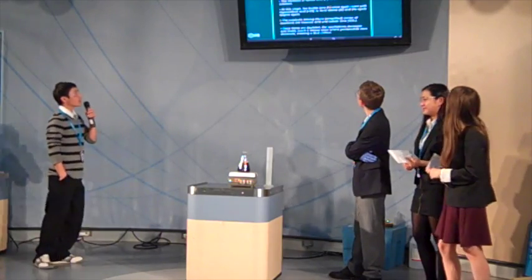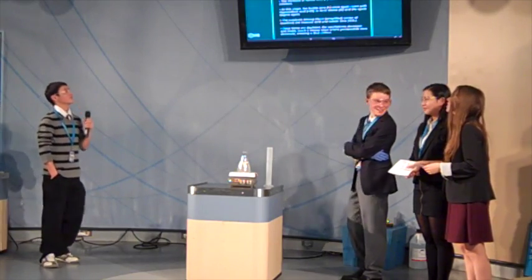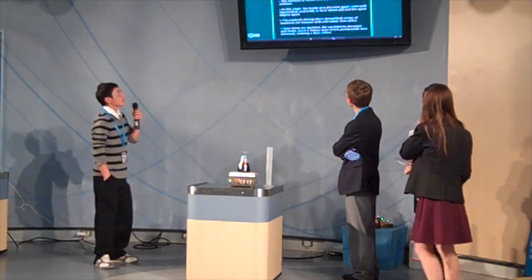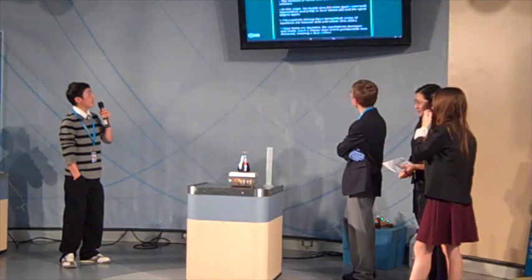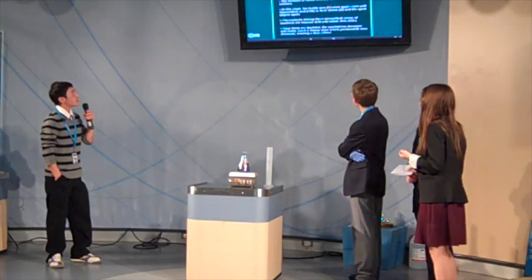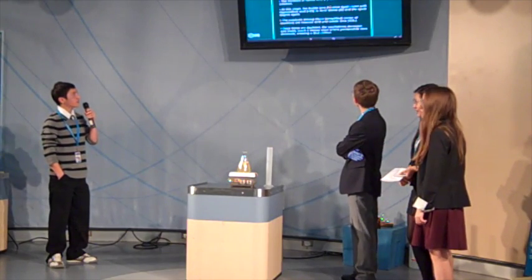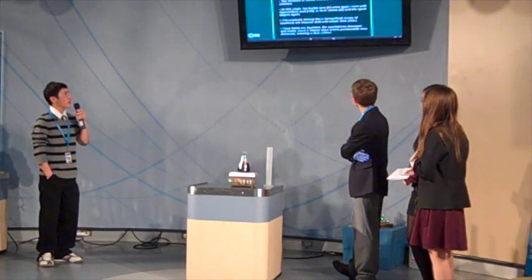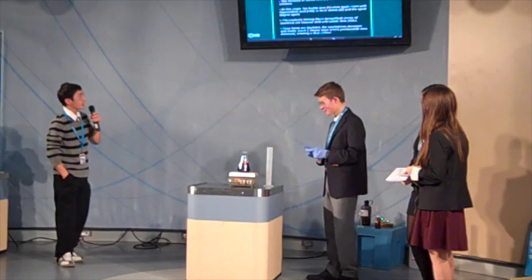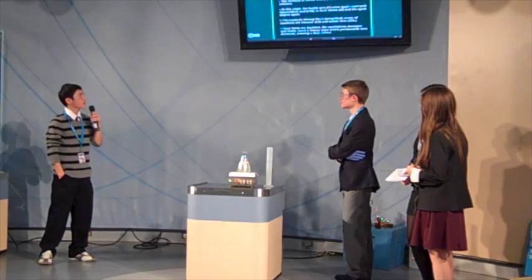Alright, so I guess the yellow color is generated when iodide ions react with the hypoiodous acid to form iodine. The blue color occurs when iodine reacts to an increase in iodide ions in the presence of starch, forming pentaiodide ions. This reaction consumes iodide faster than it is produced, causing the concentration of pentaiodide ions to decrease and increase the concentration of iodide ions again. The increase in iodide ions leads to a colorless solution, and at this stage the iodide ions once again react with the hypoiodous acid to form iodine, and the cycle begins again.